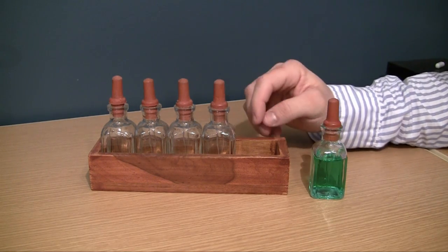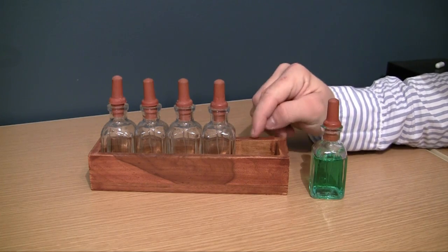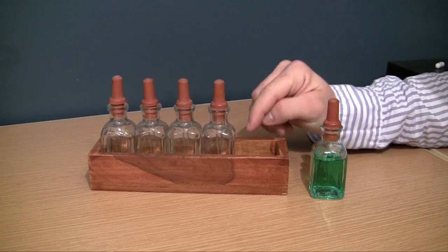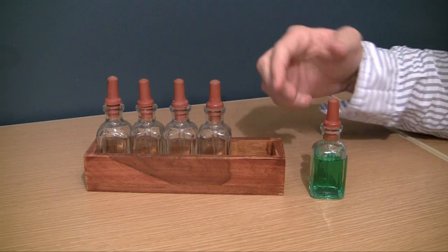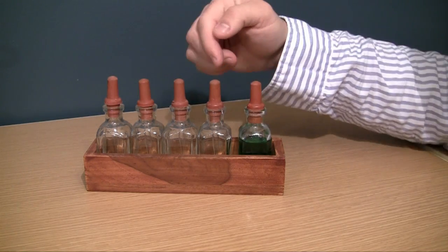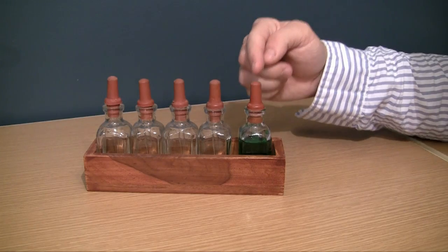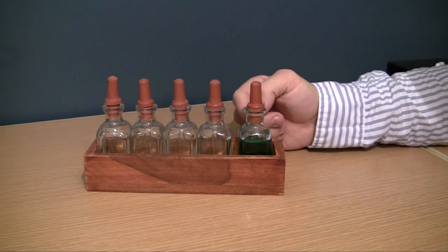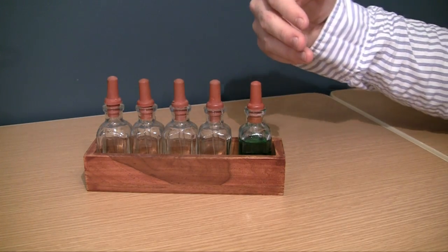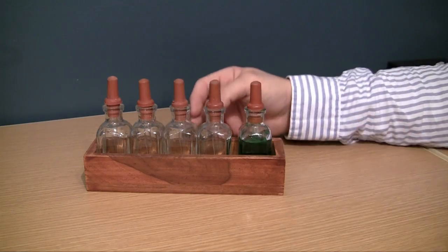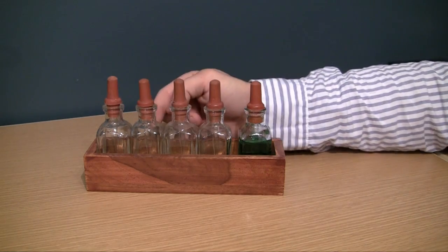And another thing as I kind of mentioned before, make sure that when you first buy them to get a rack. This rack is going to keep everything organized and sometimes these bottles are used as indicators with the lowest strength going to the highest strength so it's really easy or should I say it can get really confusing whenever they're all mixed up. But when you have a rack it makes them nice and organized.